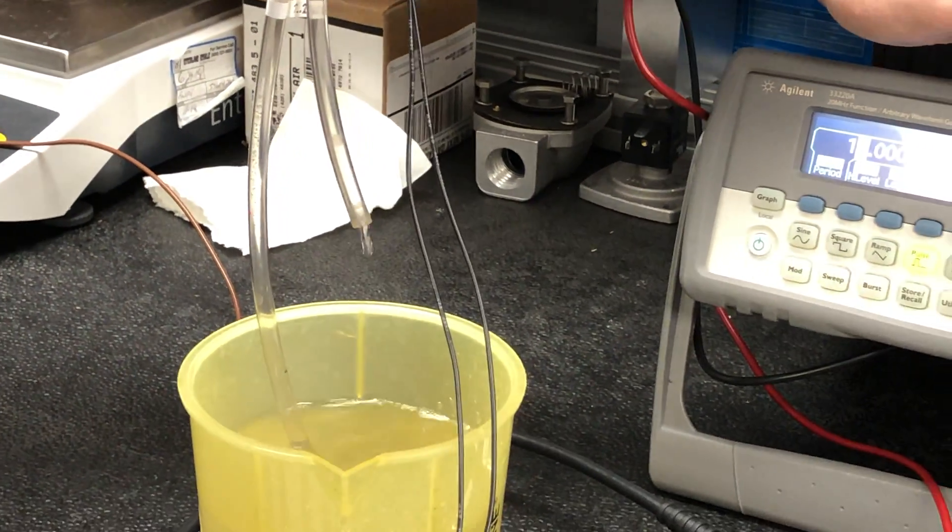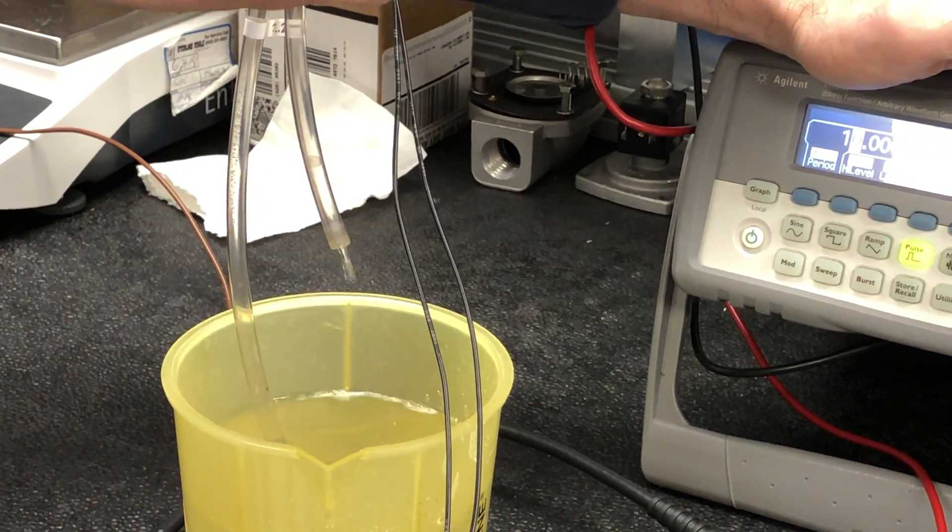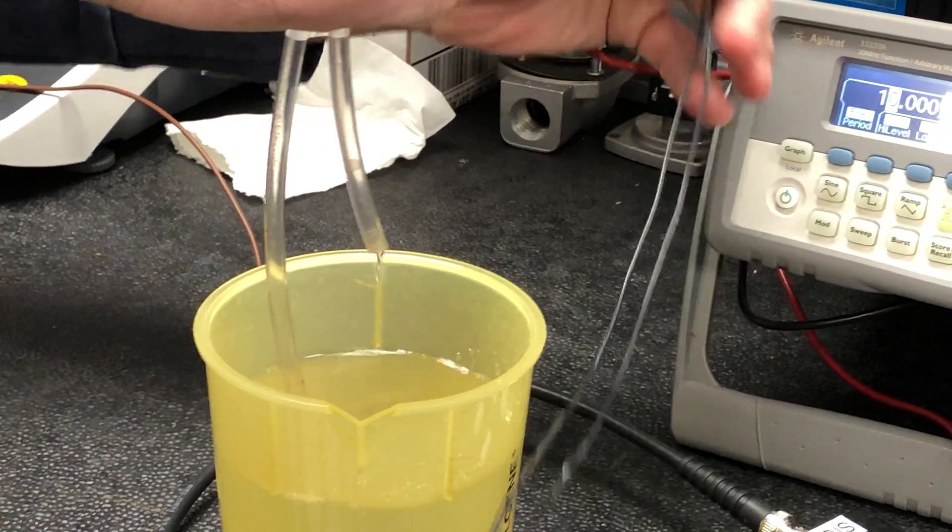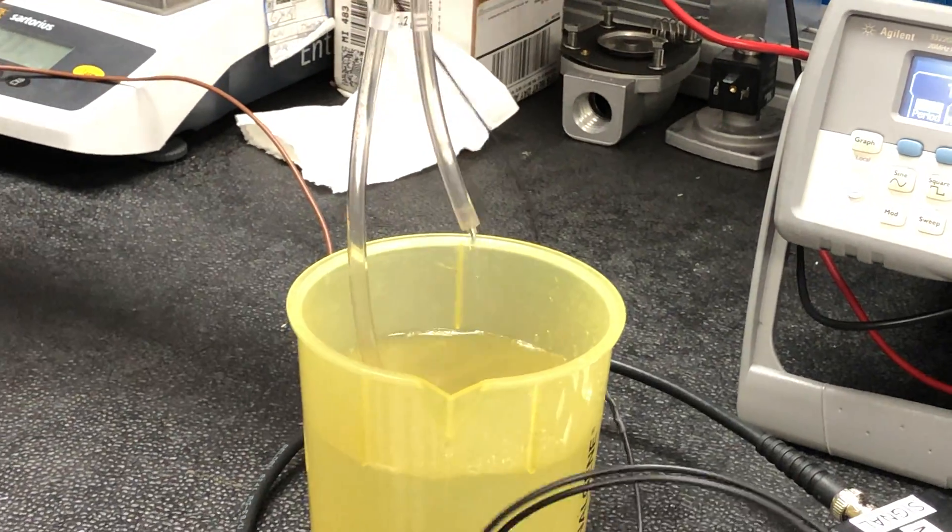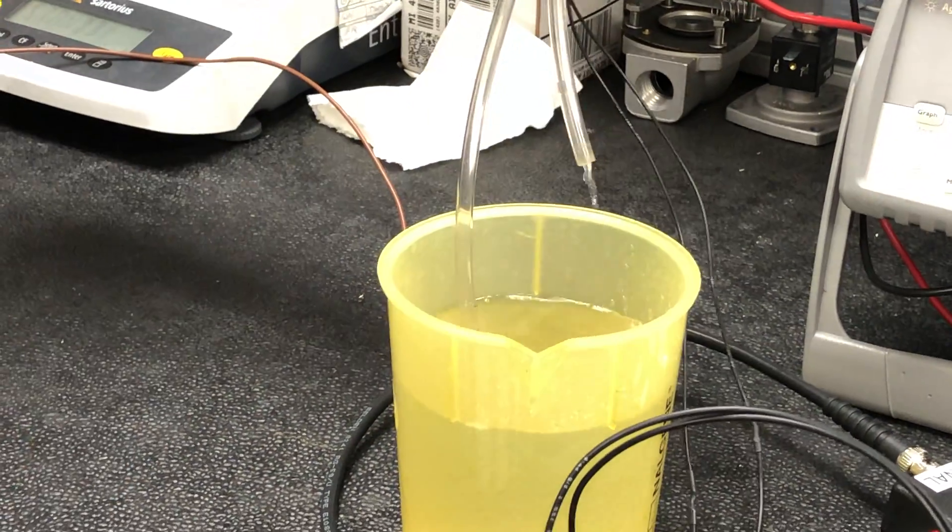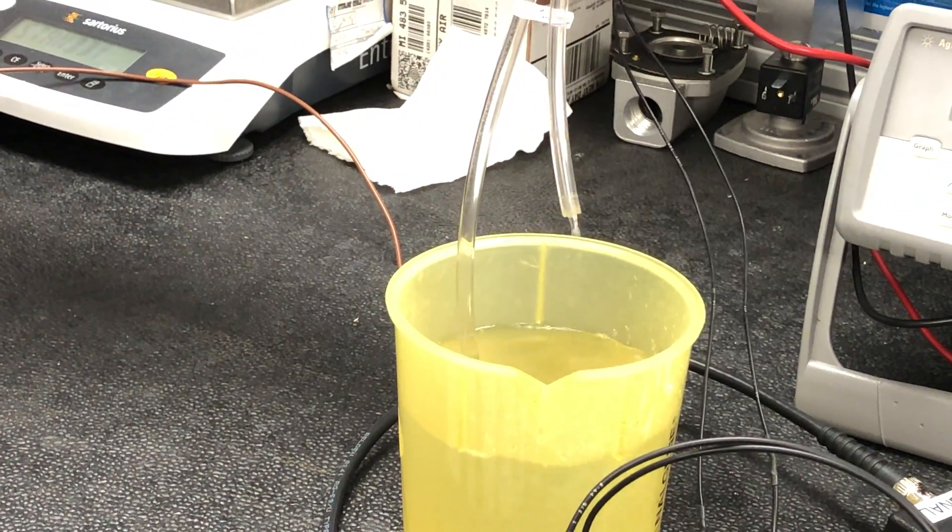What's the fastest I can go? It's about 20. Oh, okay. The 14 go a little faster. Slick. How adjustable is the dosing?